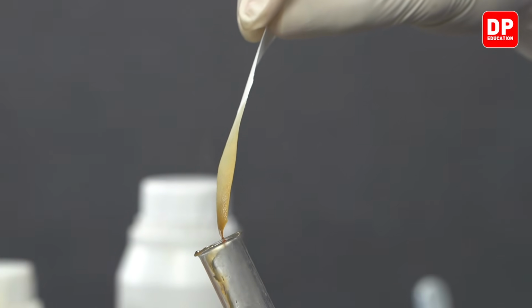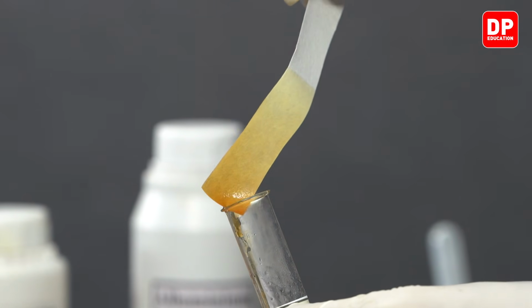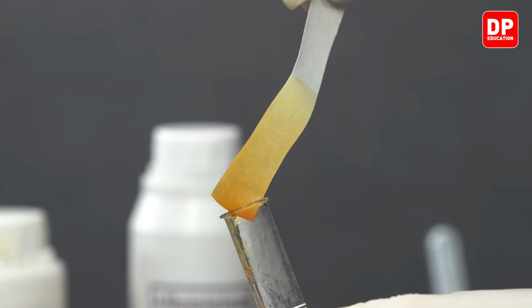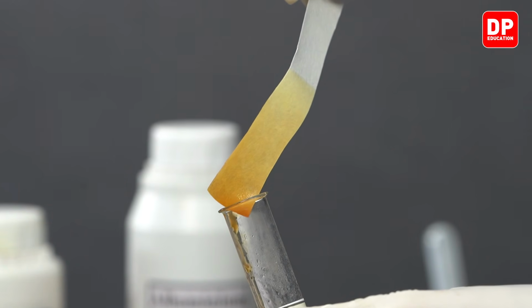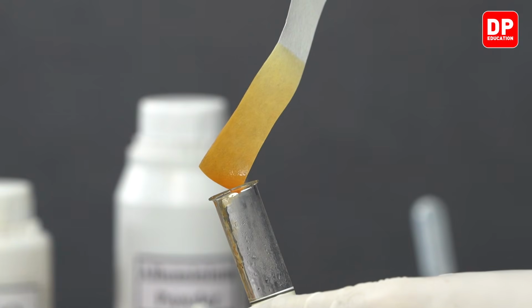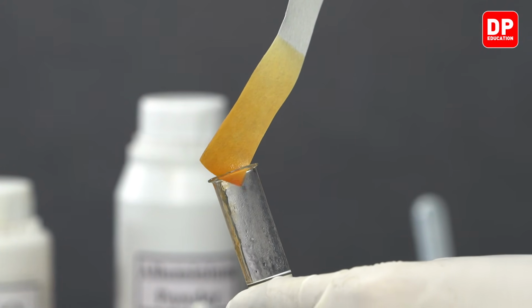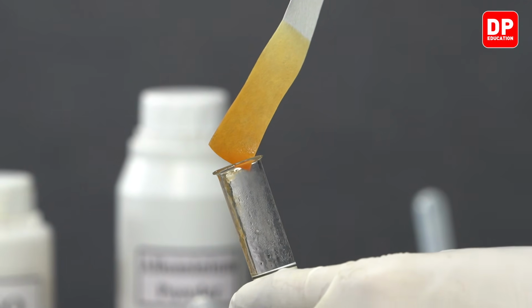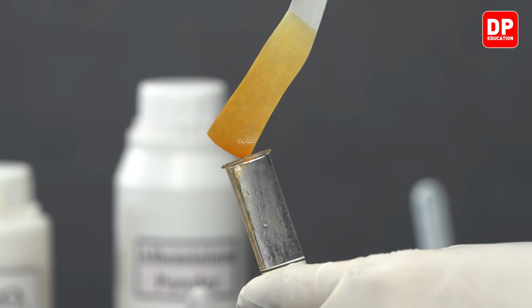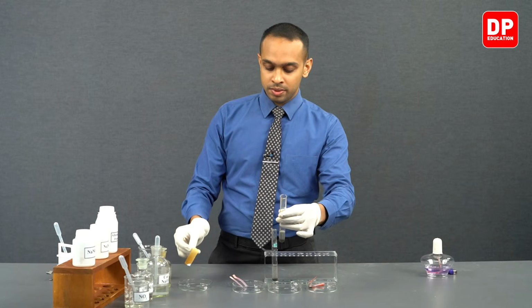As you can see, the filter paper soaked in Nessler's reagent is turning to a brown color, indicating that this is in fact ammonia gas that is released when this reaction is taking place. So this indicates that we have produced ammonia gas.